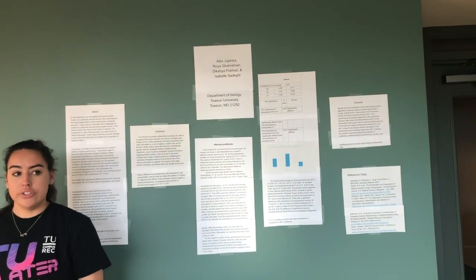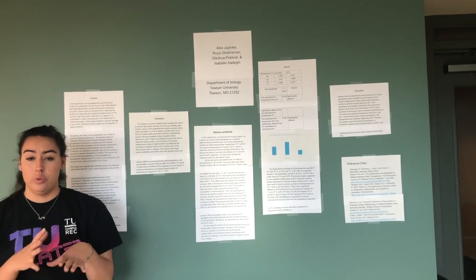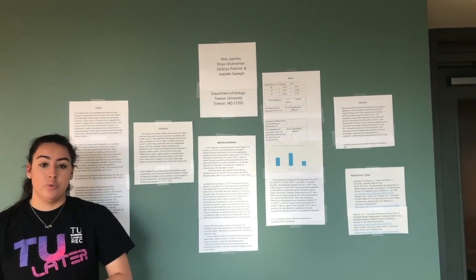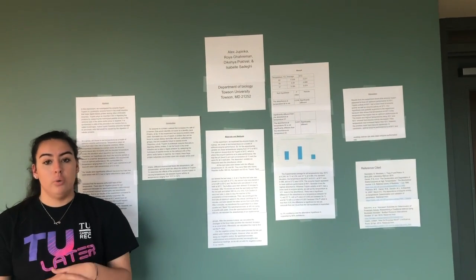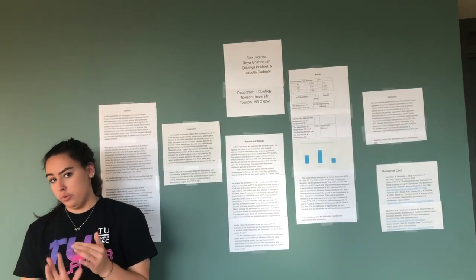So a common source of variability that we had in our experiment was with the water bath. It was problematic because this resulted in all of our tests not being held at the same temperature, which caused our trials to fluctuate in temperatures and absorbances.